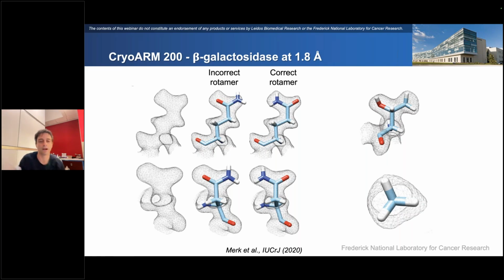So, as far as the practical benefits of hydrogen, getting to 1.8 angstroms at 200 kV was a very interesting technical result, and being able to see the hydrogens, for me the first time in my career, was really exciting. But the question is, what's the practical benefit? When you do cryo-EM or X-ray crystallography, the ultimate goal is to use the map from the experimental method to fit a model in. The better the resolution of the map, the more precisely you can fit the model, and the less flexibility there is to move around, so the more confident you are in the position of the atomic model.